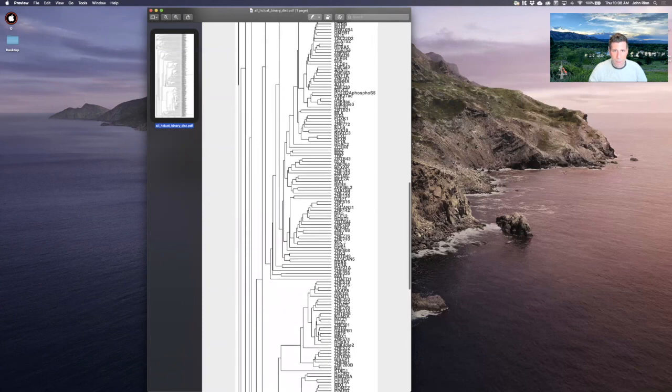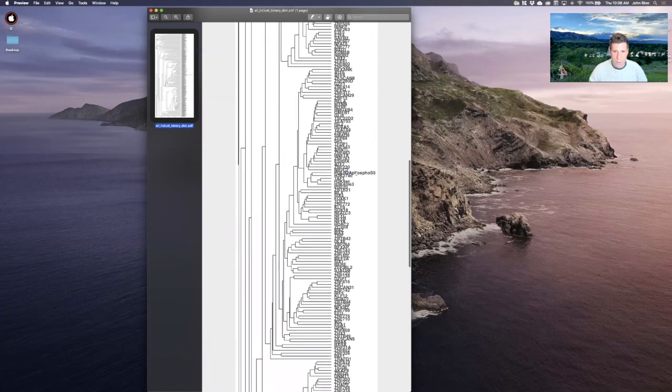And when we look up here, what we see is this phospho5, which is proximal to promoters. So the phospho2 means that the polymerase is elongating, it's making a transcript, and all is good. And what's interesting is that you'd expect an active promoter to have this histone modification, where histone H3, lysine 27 is acetylated. We'll get into this stuff much more down the road. But these are very euchromatic or very active marks, all shown clustered together. Again, our data is making sense. That's great.